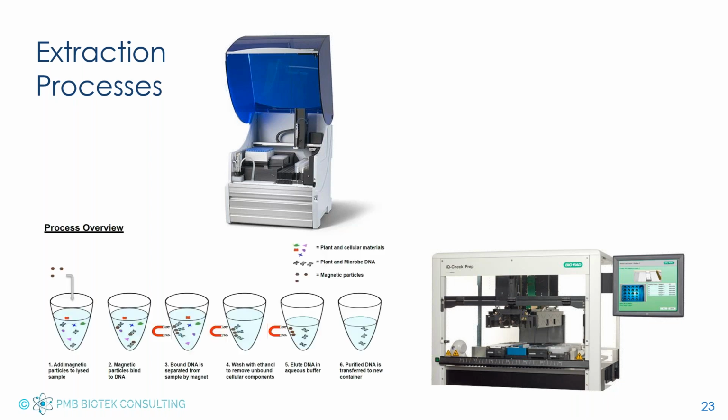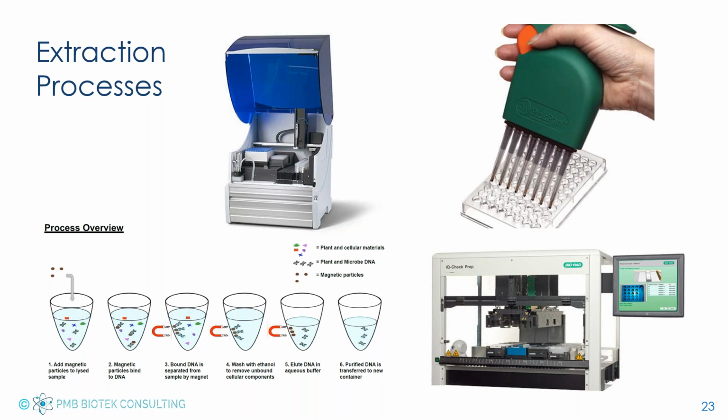I think immunomagnetic separation. So this one is already being employed in the industry, but we'll start to see other companies bring their kind of techniques into it. So whether it's a traditional IMS in a tube, where you're using paramagnetic beads to pull your target bacteria or your target DNA away, and then be able to eliminate all of your inhibitors from that sample, or whether you want to use something such as the PIC pen, which is a micropipetter that performs the IMS in a deep well plate, using the pen, which has magnets on it.